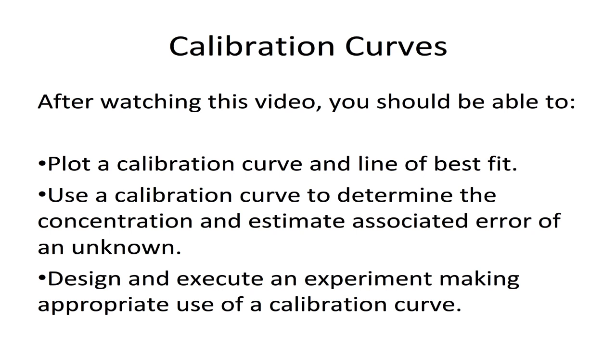Calibration curves is the first video in external and internal calibration, which is the topic for today. After watching this video on calibration curves, you should be able to plot a calibration curve and a line of best fit, use a calibration curve to determine the concentration and estimate error associated with the concentration of an unknown, and also design and execute an experiment making proper use of calibration curves.